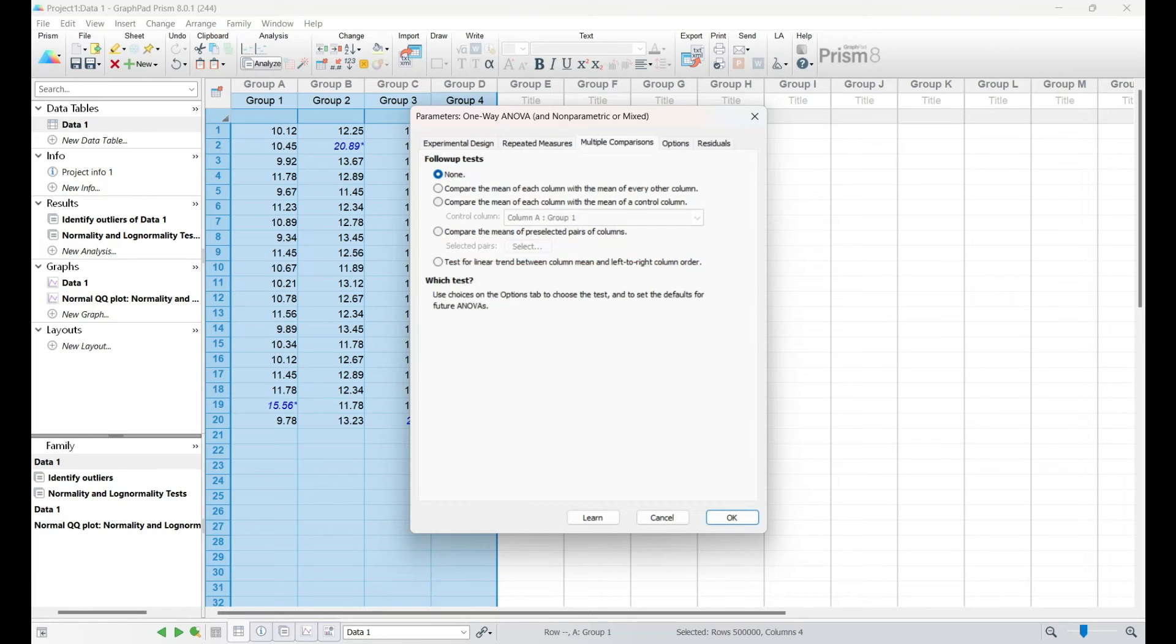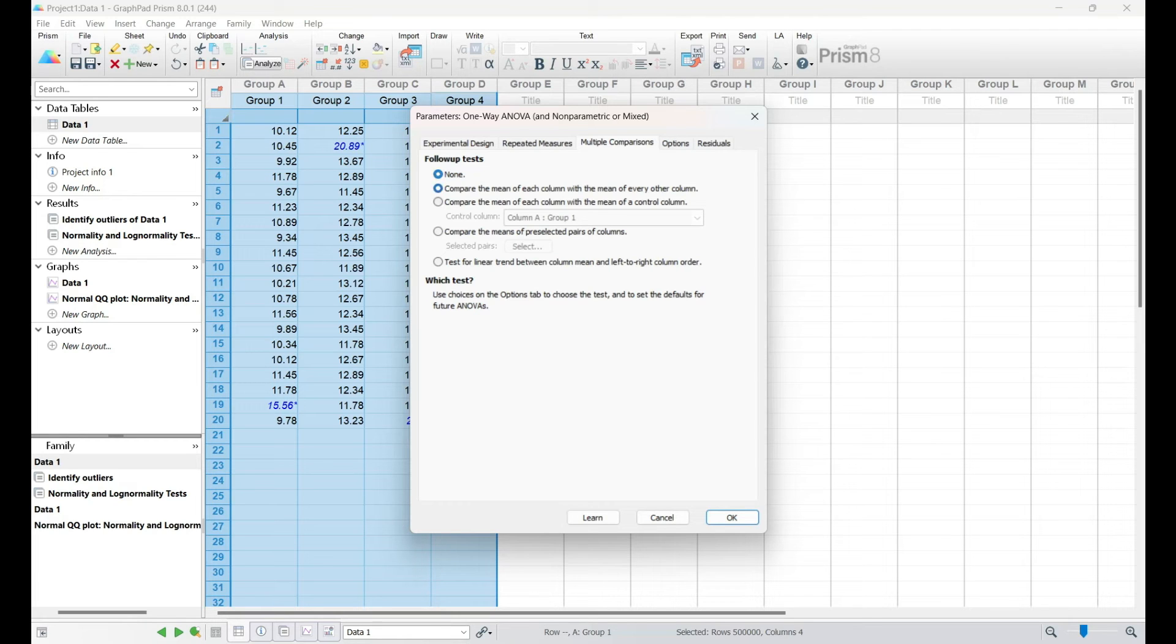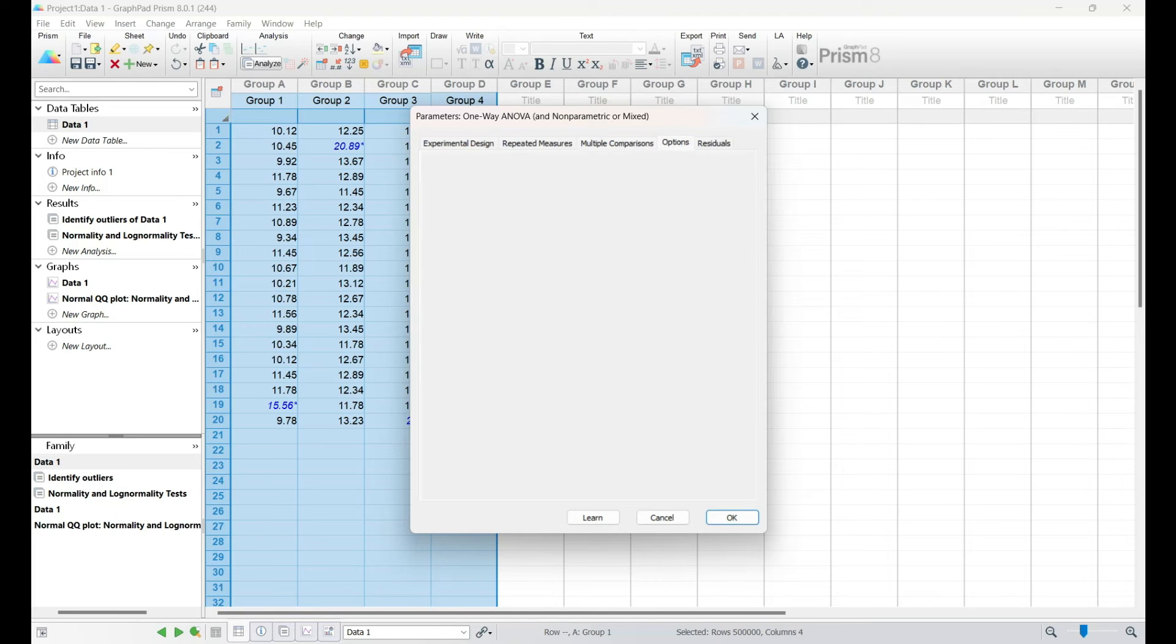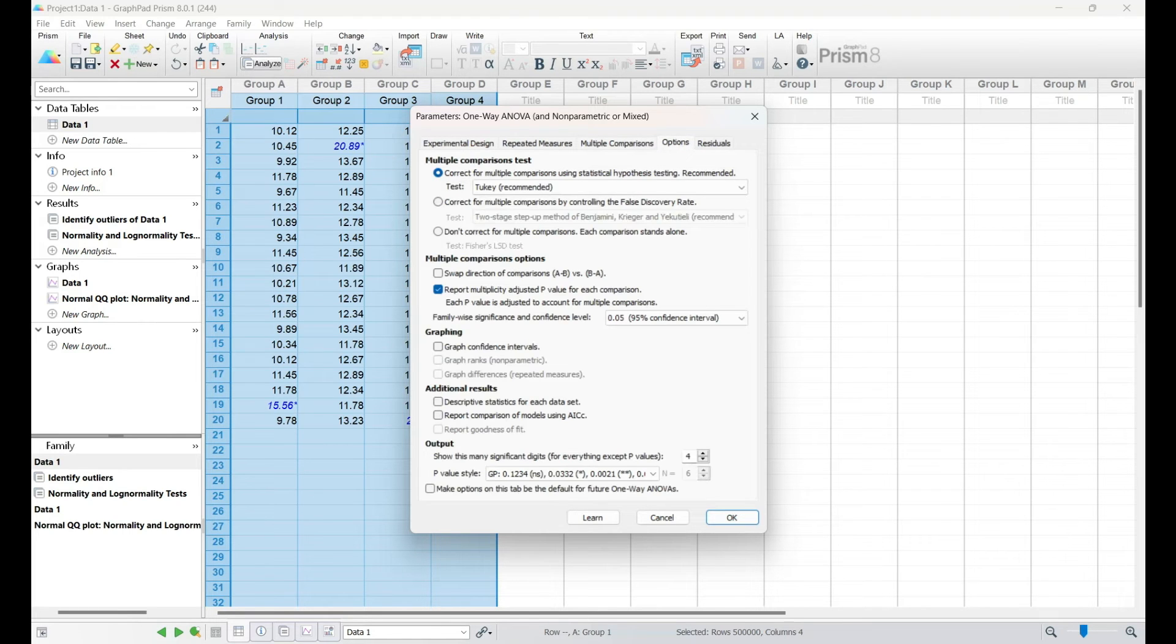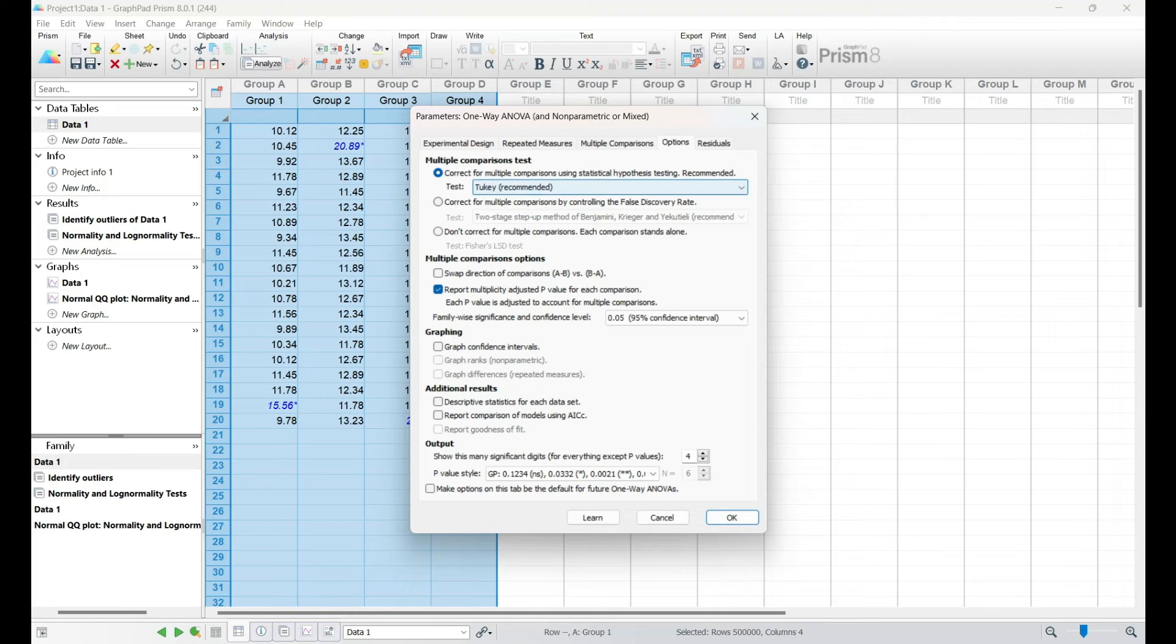After we've made the decision, I'll show you how to set up the analysis in GraphPad Prism, input your data, and configure the settings accordingly. The software's intuitive interface makes the process straightforward, allowing you to focus on the interpretation of results rather than getting bogged down by technicalities.